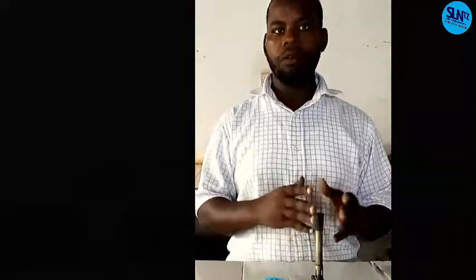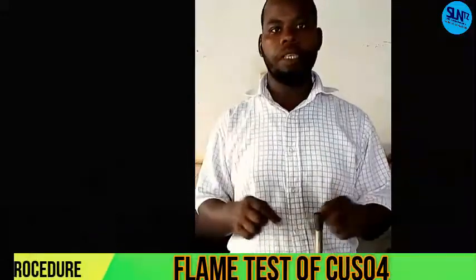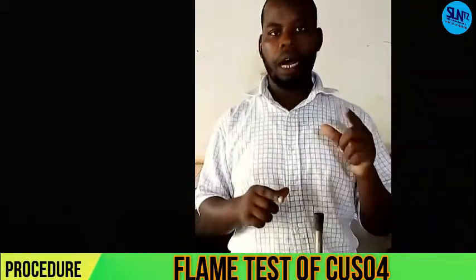How can you identify the cations and the anions of this copper through appearance, which is a very important step. Number 2, we have performed the action of heat. But now we are in flame testing. I'm going to show you what things you have to do, and we will see how to write a report after observations.